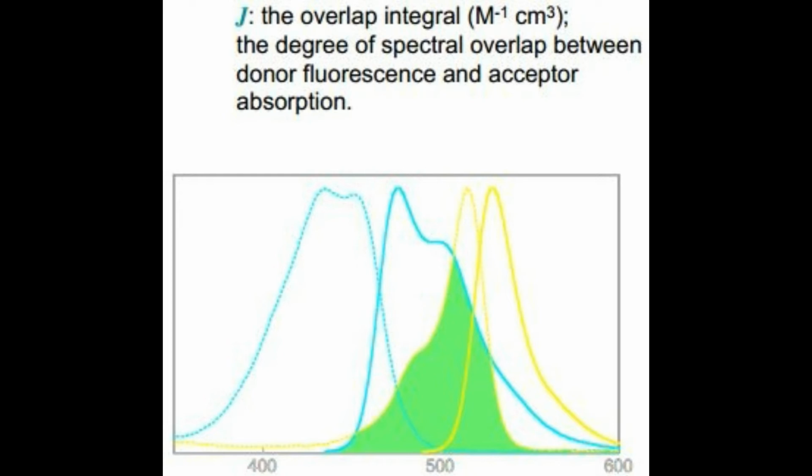So, for example, there might be a BRET experiment where one protein is able to emit a light at 395 nanometers, which can be captured by the second protein, say a green fluorescent protein, and then it can emit a green light at 510 nanometers. And this ratio of light emitted by protein A to the green fluorescent protein can be measured in the BRET machine, or whatever machine is going to detect these signals.